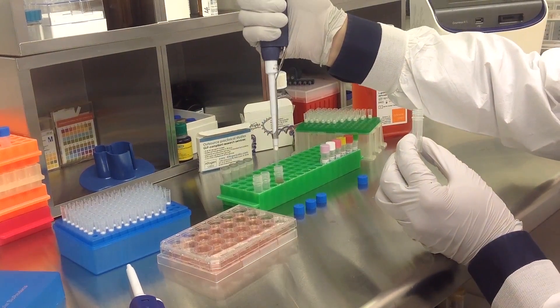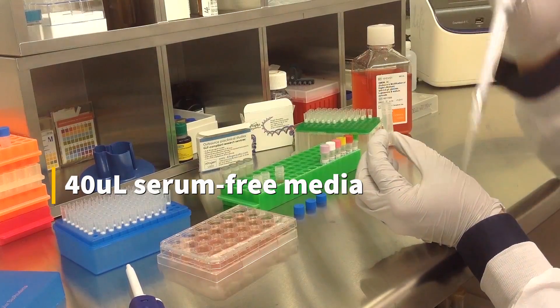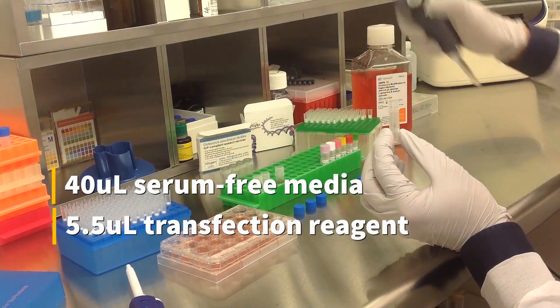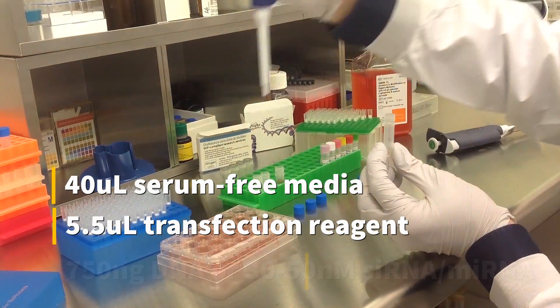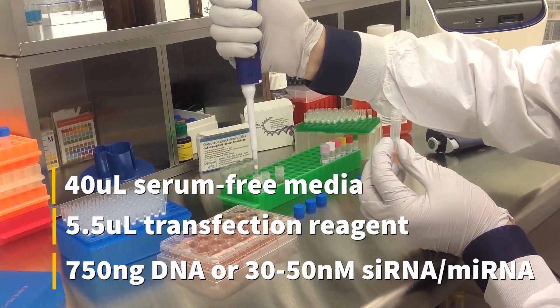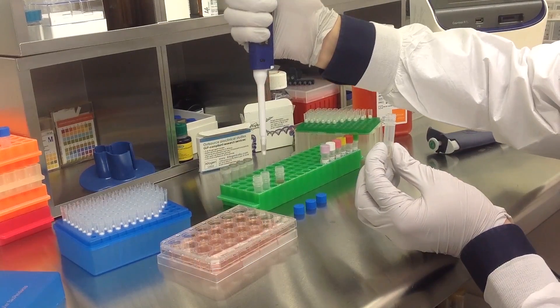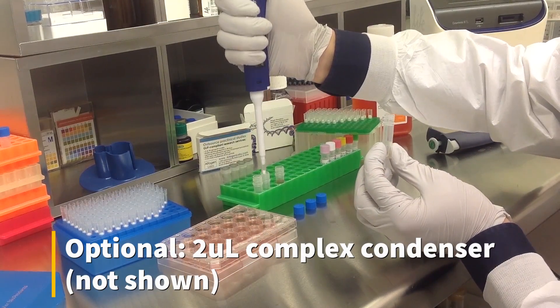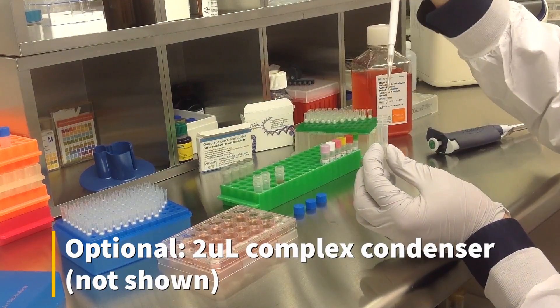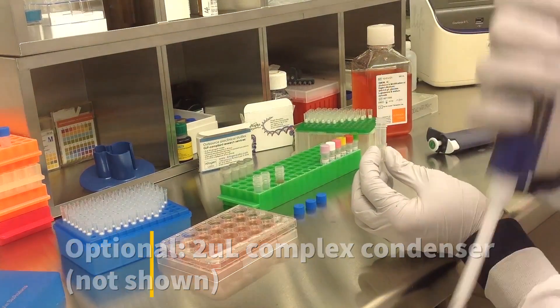To prepare the transfection complex, mix 40 microliters of serum-free medium, 5.5 microliters of transfection reagent, and either 750 nanograms of DNA or 30-50 nanomolar siRNA or microRNA. An optional step is to add 2 microliters of complex condenser, which increases transfection efficiency but may also increase cytotoxicity.